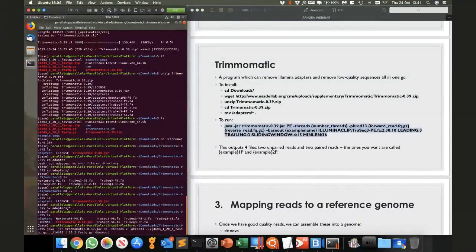So this particular fastq file is called 14683, so I might type in 14683_test. And baseout basically tells it that you want it to print the unpaired analysis out and the paired analysis out. You can type in four file names that you want, or you can just type in baseout and it will do that all automatically for you.